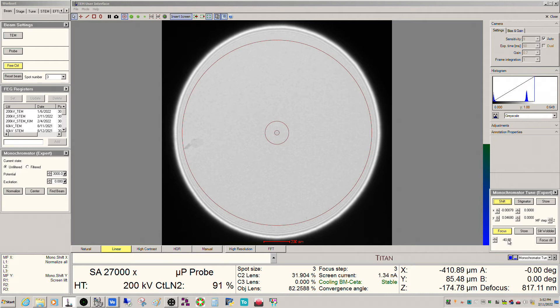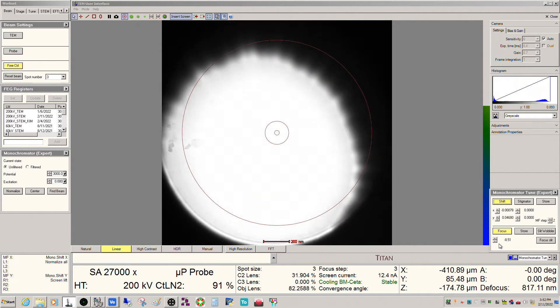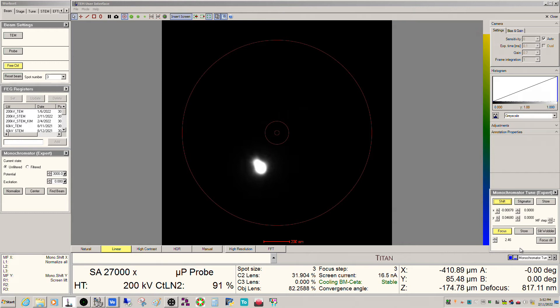As I take the intensity knob and go towards zero, we're going to see the beam come to a crossover — this is the monochromator focus. You can see it's a little bit off; that can be recalibrated but it's not terribly important for this. So now we have the entire beam basically coming through the condenser aperture.